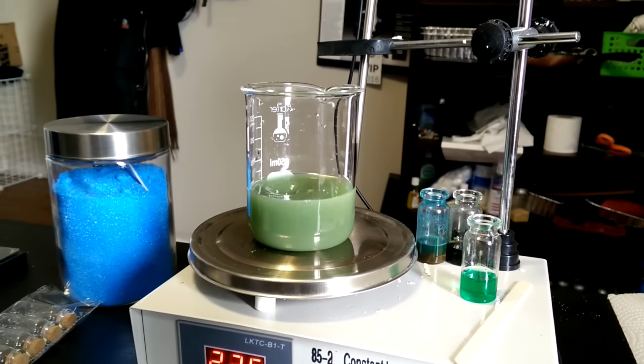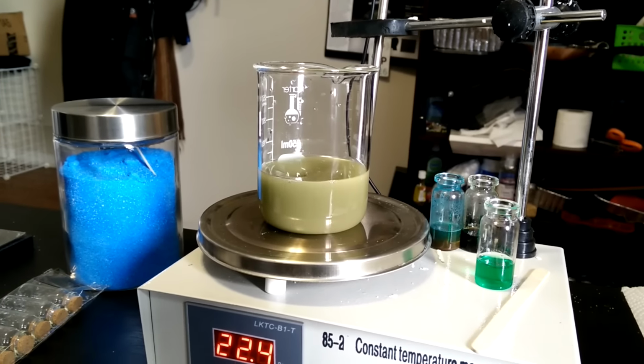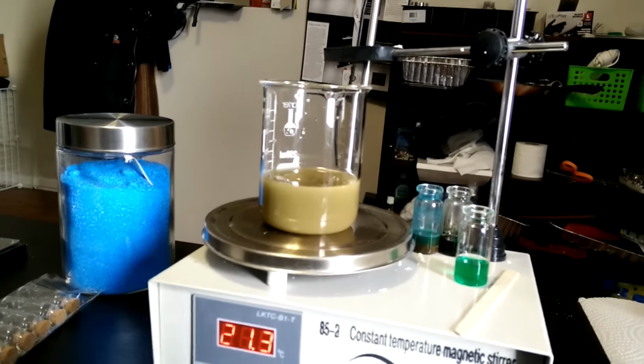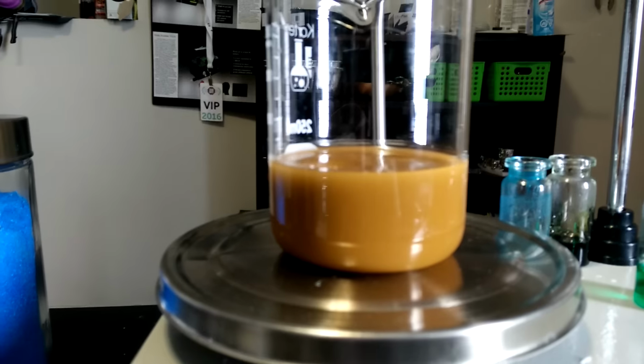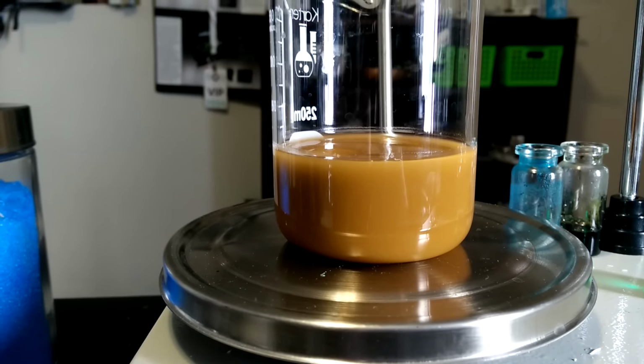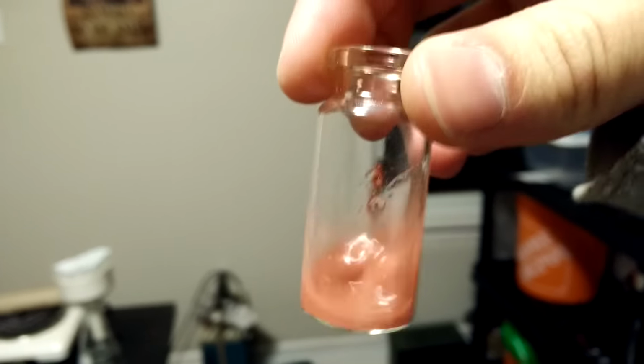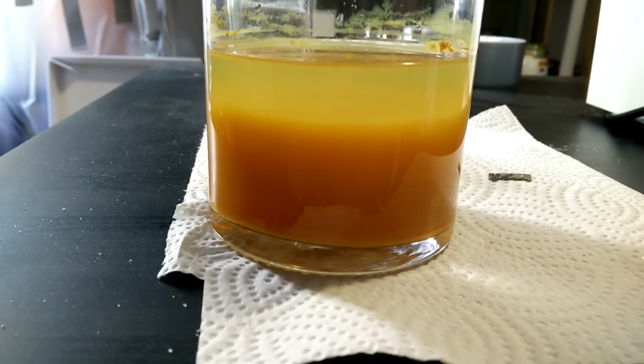Ascorbic acid is just vitamin C, here I'm using it in its pure form. The idea is to reduce the hydroxide down to copper oxide. If you add too much ascorbic acid, the copper oxide will be reduced further down to particles of elemental copper. So only add small amounts at a time and wait about 20 minutes between additions. You're aiming for a canary yellow solution.